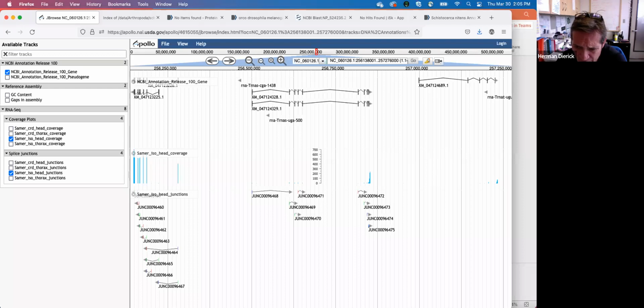Then I find the coordinates that way, type in the coordinates in NCBI, and then I have the gene, and I download it. So for me, I do all of this in SnapGene because I need sequence data for cloning, not for annotating. So I annotate because I want to clone and find guide RNAs rather than the other way around.